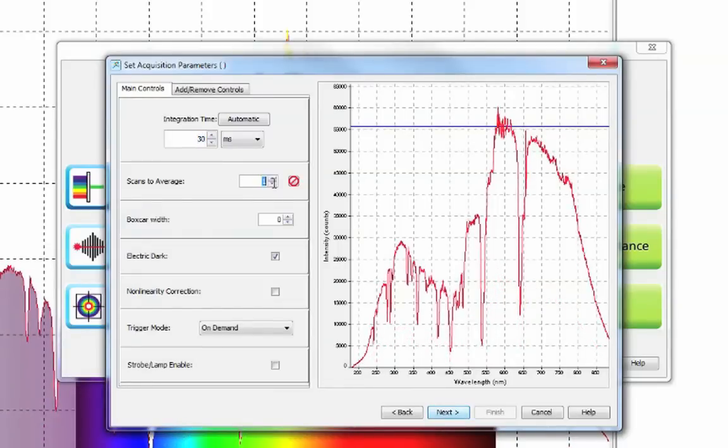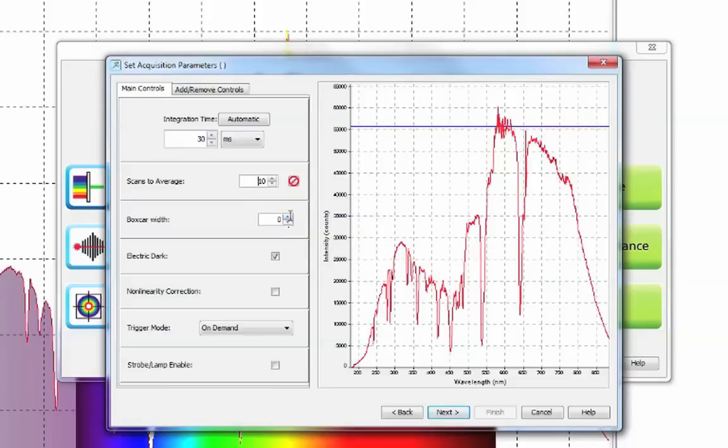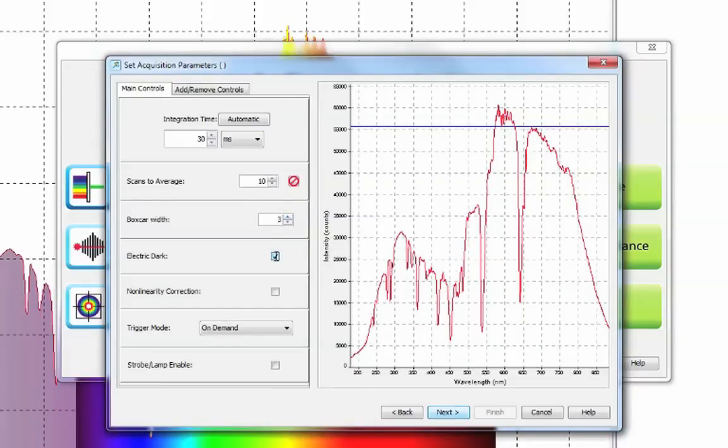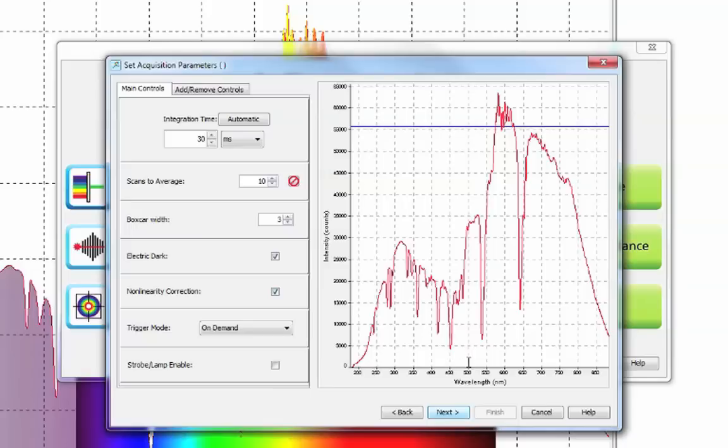Some averaging is often useful and you can also decide if you would like to apply boxcar averaging, electric dark and non-linearity correction. You can always alter these parameters later but make sure you take a new dark and reference if you do.